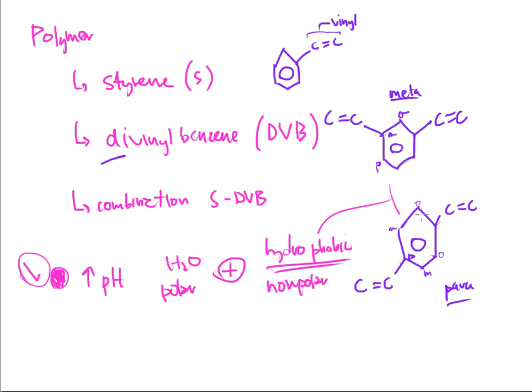We've got to put some makeup on it. Okay, we've got to make it a little more attractive, and it seems like makeup does that to some guys. I don't know why, but it does. So these particles, we're going to have to make them a little more attractive. That hydrophobic structure is going to have to become more hydrophilic instead.